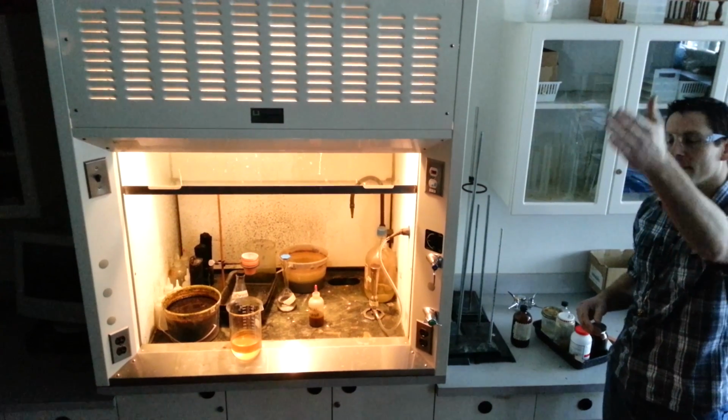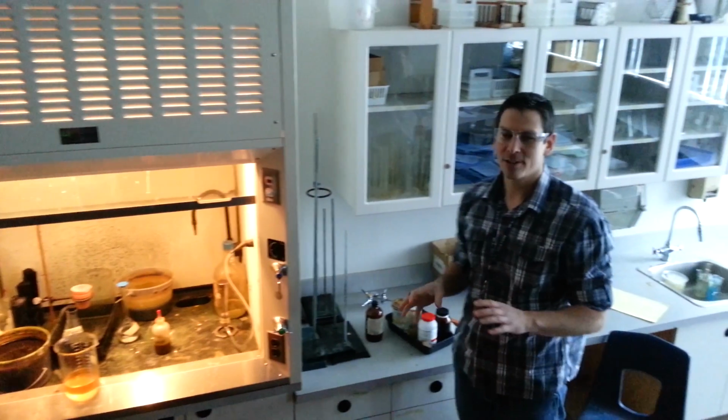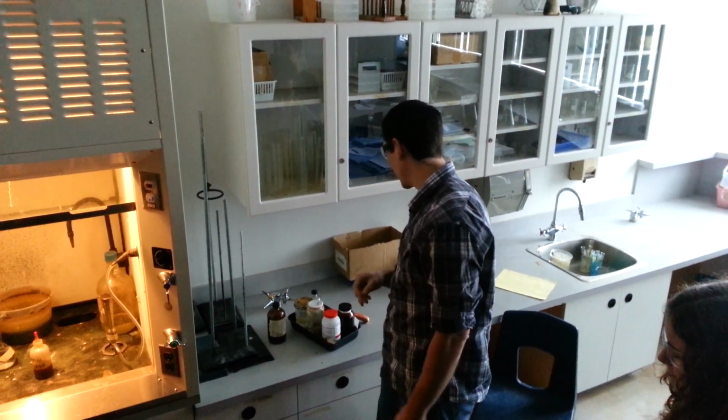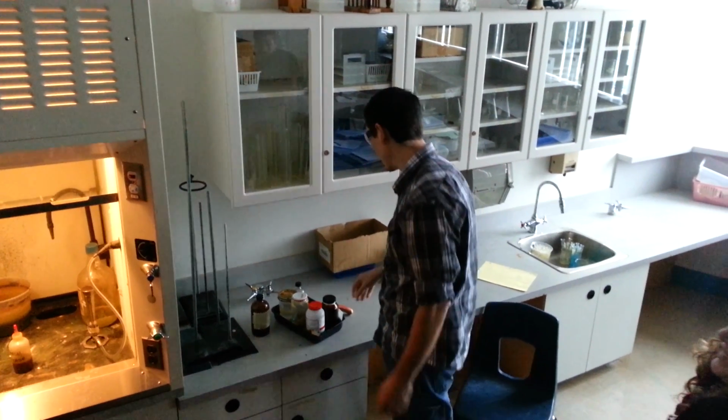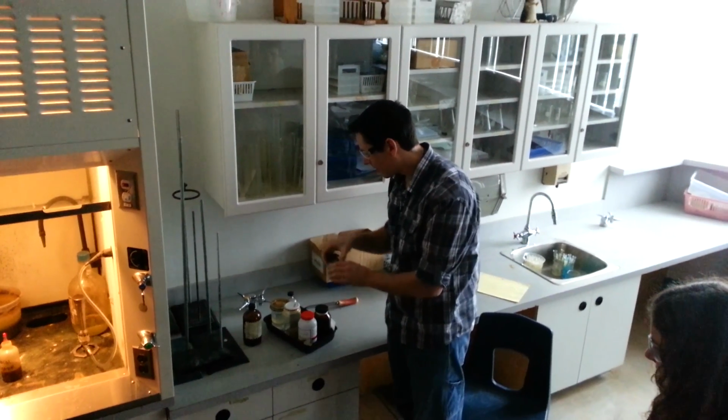Now, all the members of that first column, with the exception of hydrogen, are alkali metals. Hydrogen's special. It's kind of a family of one on its own. And we're going to see how the chemical reactivity of all this is pretty similar. So I'm going to grab the lid.